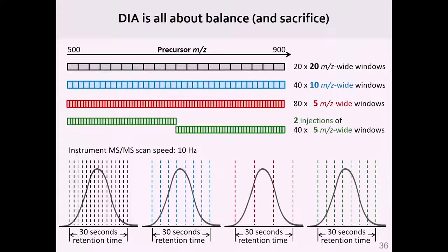There is a downside to this, and that is that instrument time is money. You're basically depreciating the instrument cost per unit time. And so if you have to double the number of analyses per every sample that comes in, you're basically doubling the cost, right? So this tends to result in a little bit of a challenge.